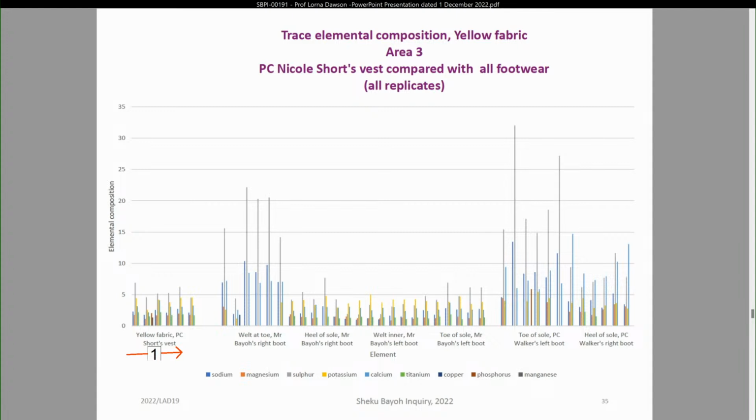On viewing these results, what can you tell us about the soil sample taken from area 3 of the vest? If we look at the 6 individual plotted replicate profiles, the second replicate is slightly tending towards being different, but you would still include it within the analysis.